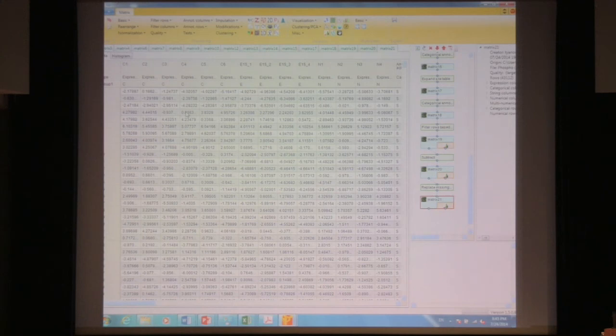Just to comment on that, if you're using SILAC as an internal standard and you invert the data, meaning that you're looking at ratios of L to H, and based on the fact that we do match between runs, then you can assume that where you didn't find a ratio value, it is because the light intensity, so basically the experimental sample, is very low.